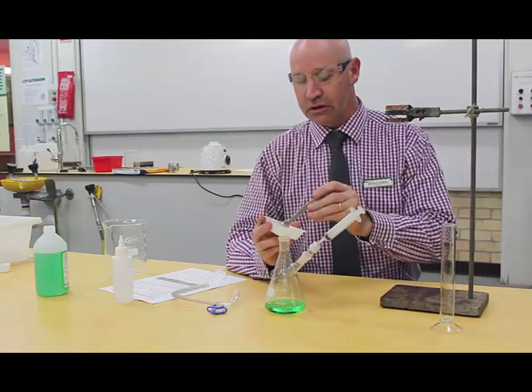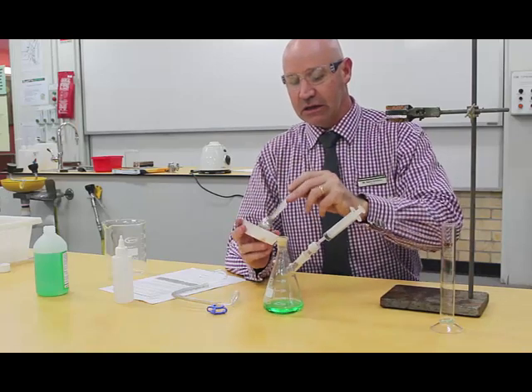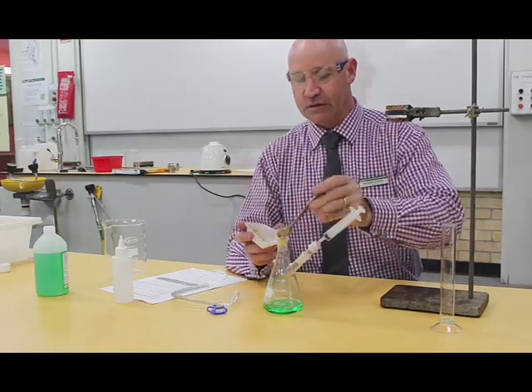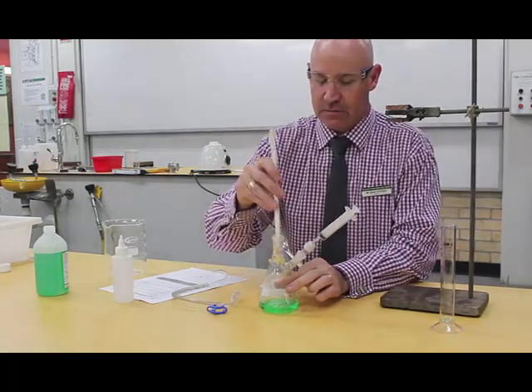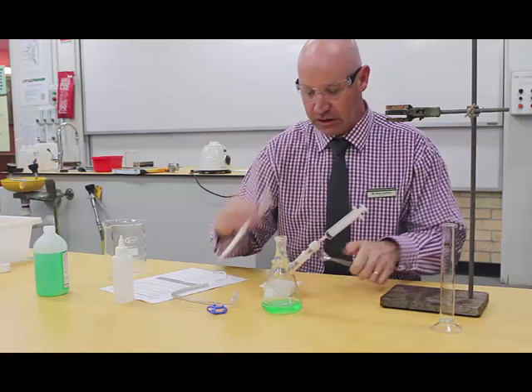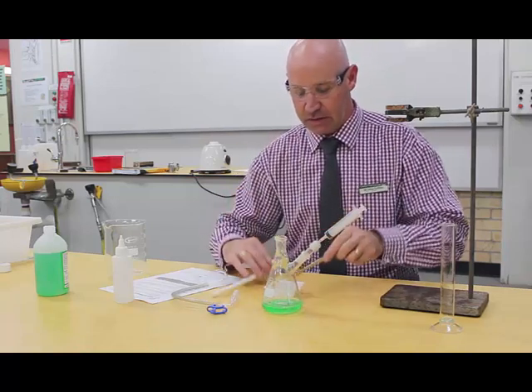So I'm going to put the minced potato into the flask. I push the potato into the flask using the stirrer. So I'm going to get all 10 grams in. 10 grams of potato in.